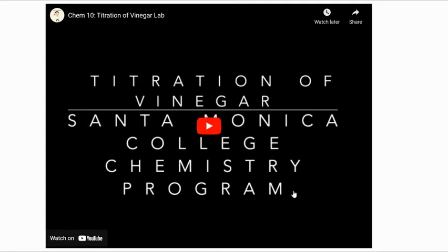As you watch the video, please make sure that you pause. You will have to actually pause the video so that you can take the time to measure the initial and final volumes for each of the 3 trials, and then we'll wrap it up together.